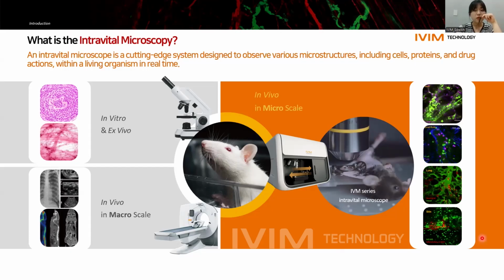In contrast, intravital microscopy enables real-time tracking of drug behavior, biological responses, and disease progression at the single-cell level within living animals. It is a powerful tool for visualizing complex biological dynamics with both high spatial and temporal resolution.